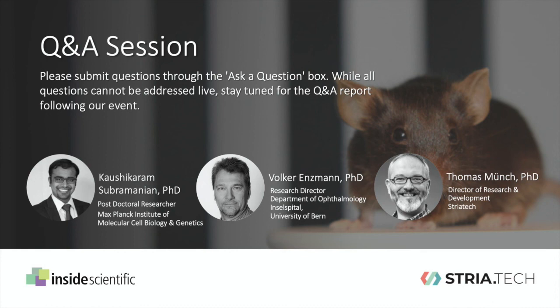Wonderful. Volker, does the extent of retinal damage influence the measurement method of choice? Yes, it definitely does. In general, you could say the larger the damage, the easier it is to measure the functional effects. And vice versa, a smaller focal damage in the retina needs to be quantified with more sensitive and especially locally circumscribed methods.